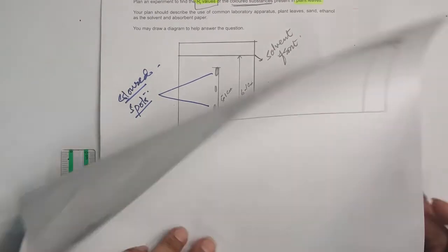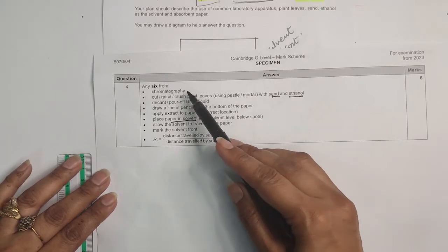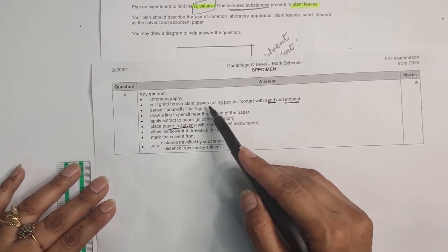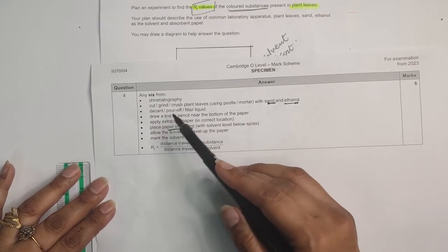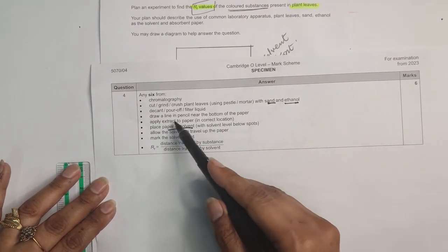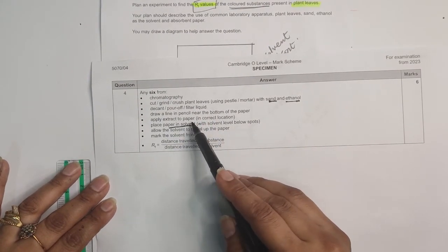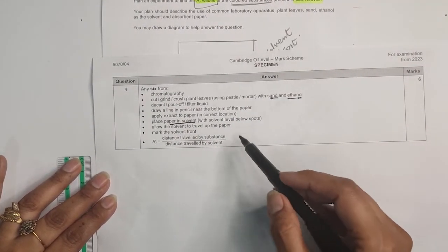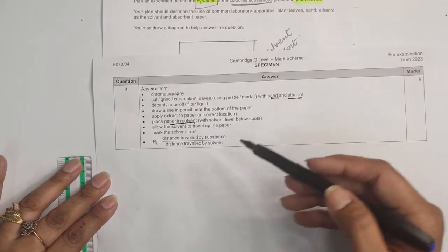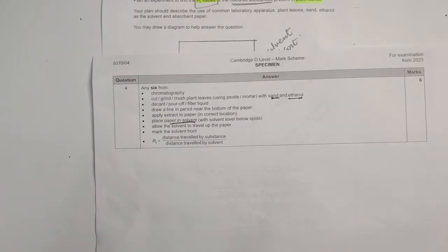Now come back to this marking key. Have we answered accordingly? Chromatography is a technique. Yes. Cut and grind crushed plant leaves with sand and ethanol. Decant, pour or filter the liquid. We take a dip of that liquid and put it on the baseline, which will be drawn by pencil. Apply extract on paper. Place paper in solvent, that is our ethanol in this case. Allow the solvent to travel up the paper. Mark the solvent front. RF value is equal to distance traveled by the substance divided by distance traveled by the solvent.